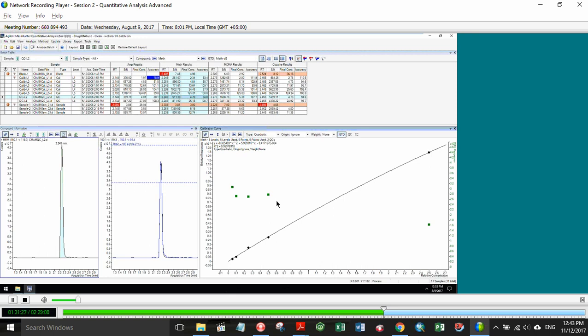I hope that answered that question, but that's basically what's happening in the quantitation world. There's a lot that's going on. Most people wind up using the method of internal standards, and the reason why is the method of standard addition requires a minimum of 3 runs to get one answer.